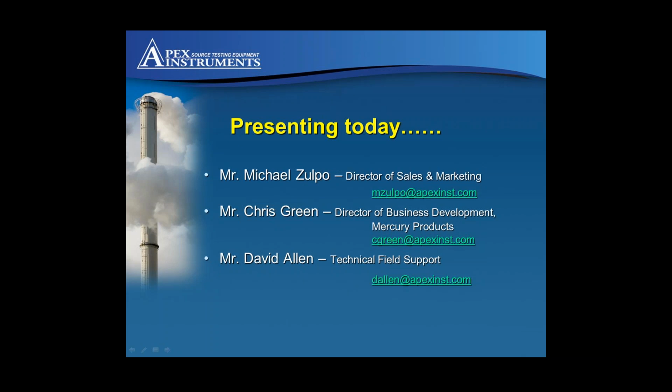Depending on the time frame the EPA is working on, I know they're completely understaffed right now, there is a possibility of them approving that, and you could do your gravimetric method from the moisture we collect. We don't have an answer for you right now, but that might be possible in the future.